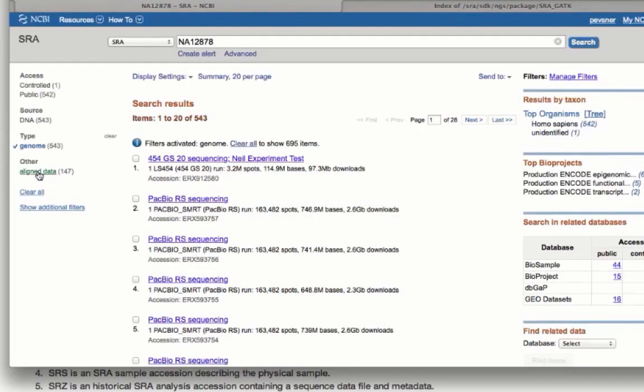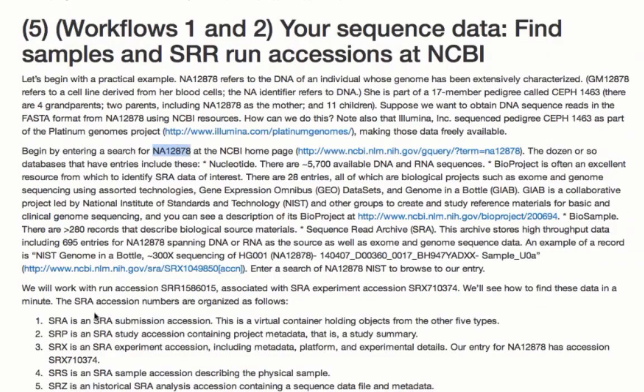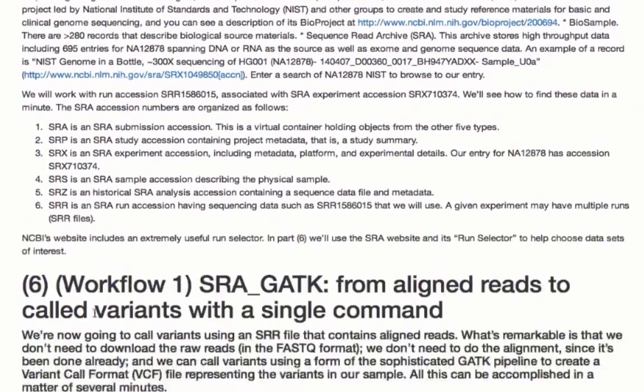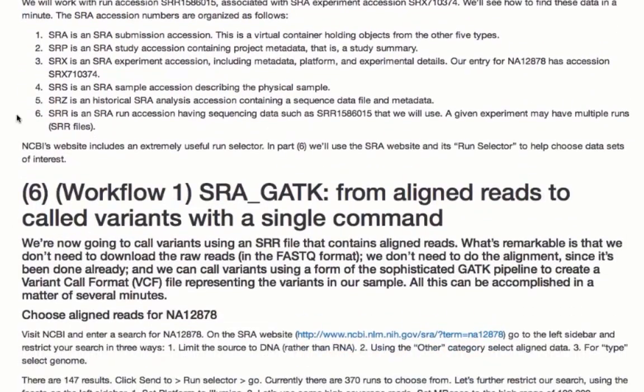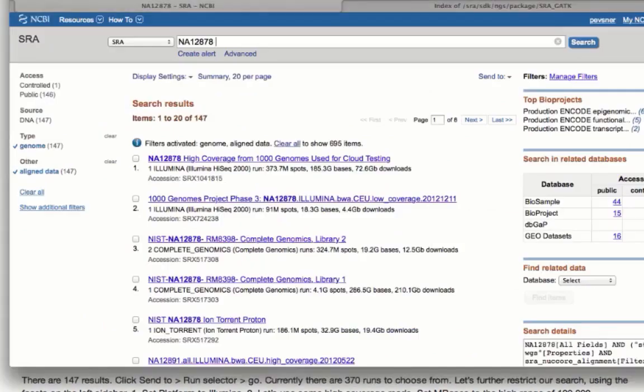The individual entries here are particular SRX or run accessions. And so let me take a moment and tell you about those. SRA, the sequence read archive, has an accession number. This is a virtual holder with SRA. SRP has the project metadata. SRX is an experiment accession. SRS is a sample accession describing the physical sample. We don't really use SRZ. And what we're looking for today, SRR, is an SRA run accession with information such as this one here that we can use.